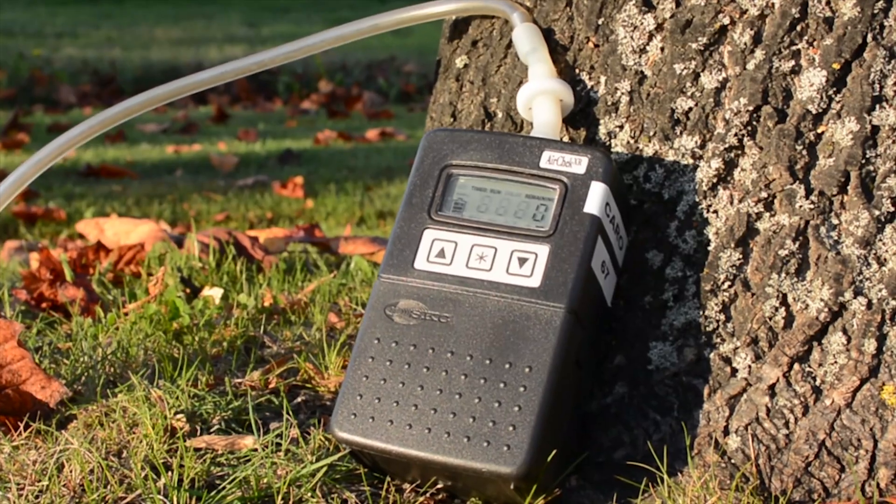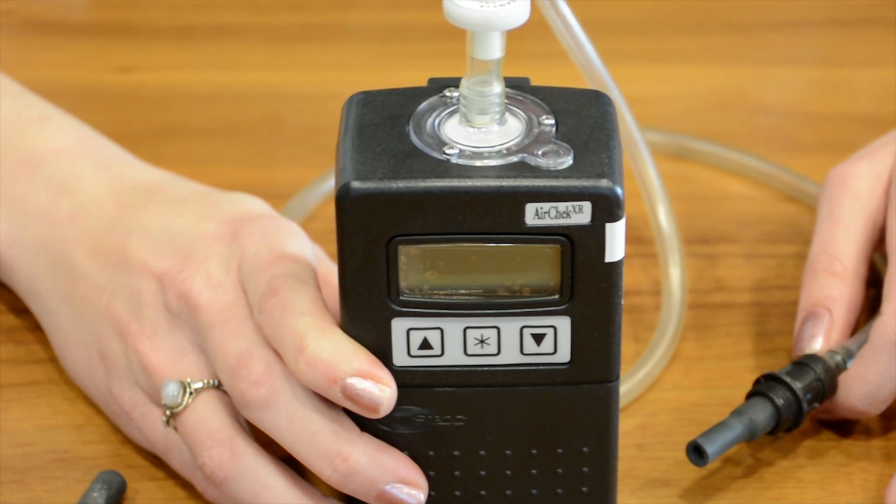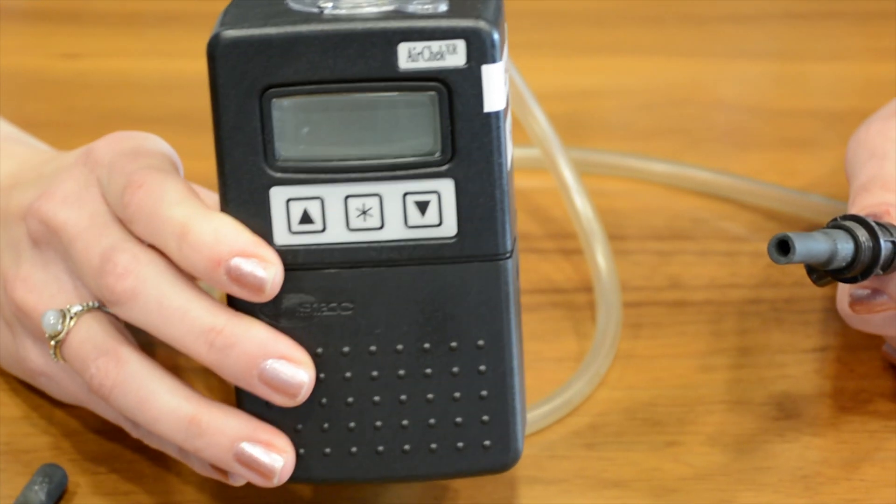Hi, my name is Jen and I'm the VOC team lead here at Carrow Analytical. If it's been a while since you've done soil vapor sampling, or maybe you haven't at all, today I'm going to show you how to be a soil vapor pro. All the stuff that you're going to need for your sampling site will fit inside of this cooler here. Let's have a look at it.